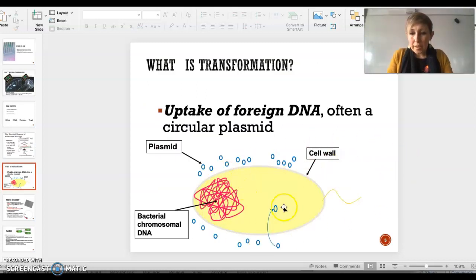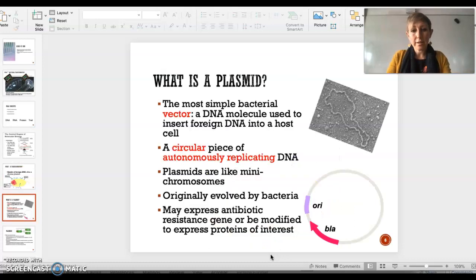So this is a stylized drawing of the bacterial cell that we'll be using. Now remember that bacteria have a single chromosome, a loop within the cell, and that holds most of the genetic information. But these tiny loops are called plasmids that you can see scattered around the cell here. And what they can do is they can enter and leave the cell. We're going to try and encourage the recombinant plasmid, so the genetically engineered plasmid that has the GFP gene incorporated into it, to get inside the cell, and then the E. coli will express the traits.